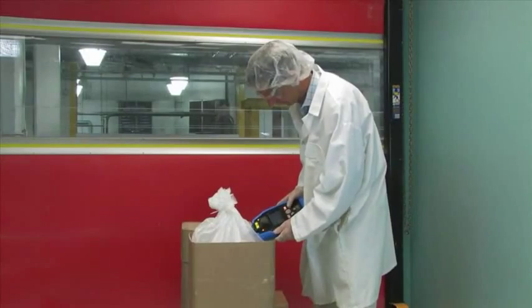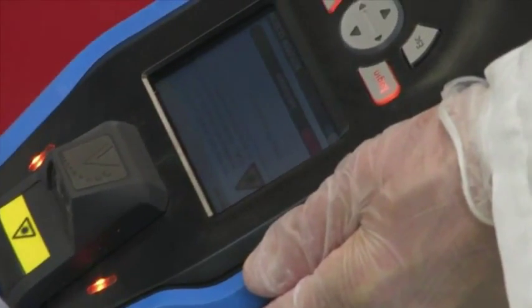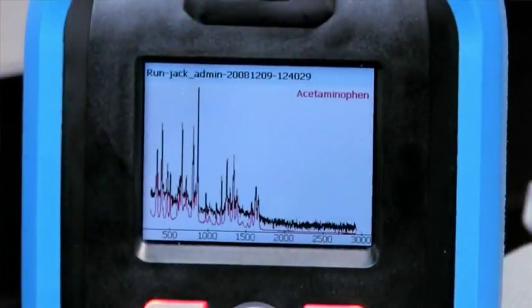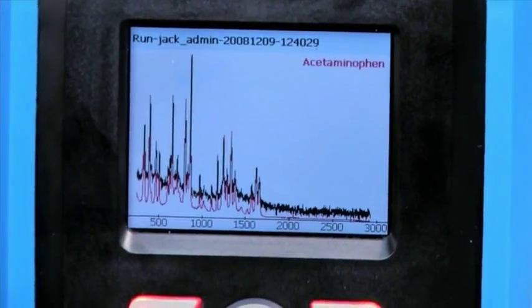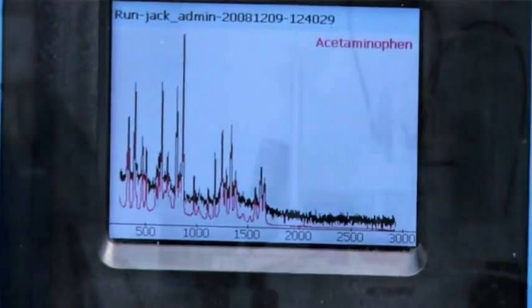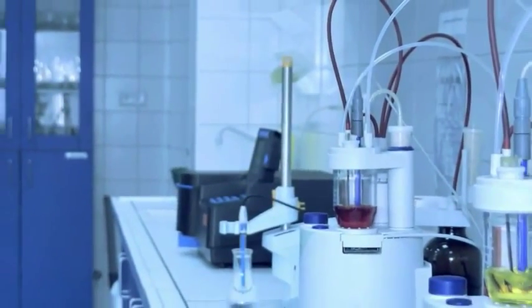TruScan provides clear, pass-fail results that are based on spectral comparisons to the user-defined and built-in libraries. The results achieved by TruScan for this application are equivalent to benchtop laboratory systems.